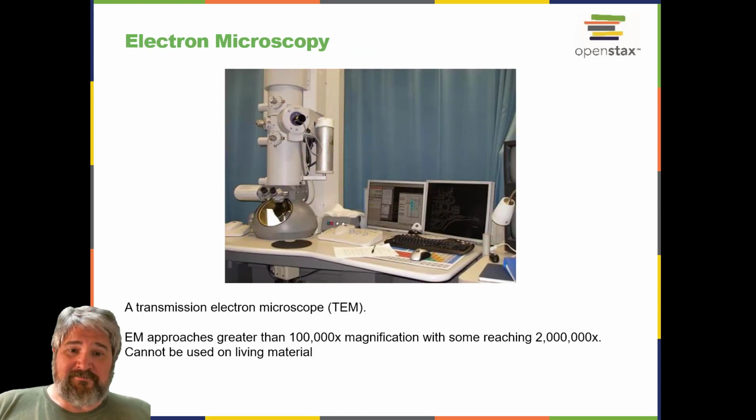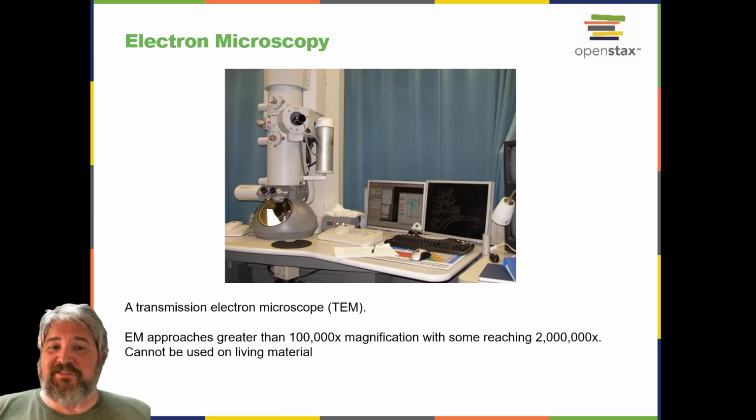Electron microscopy. The maximum theoretical resolution of images created by light microscopes is ultimately limited by the wavelength of visible light. Most light microscopes can only magnify 1,000 times, and a few can magnify up to 1,500 times, but this does not begin to approach the magnifying power of an electron microscope, which uses short wavelength electron beams rather than light to increase magnification and resolution.